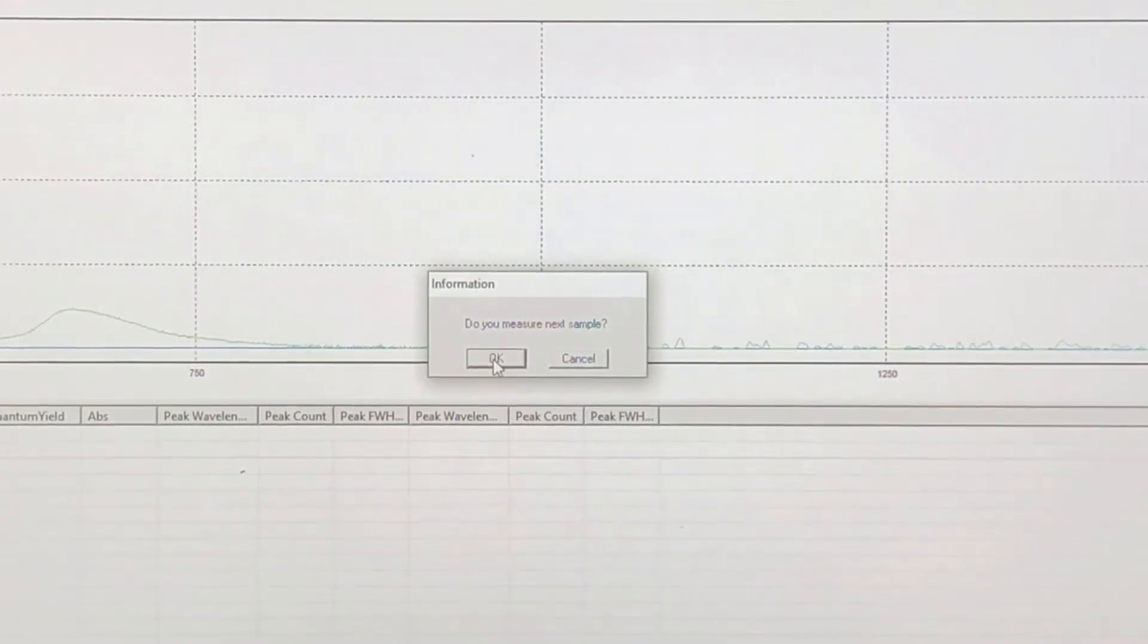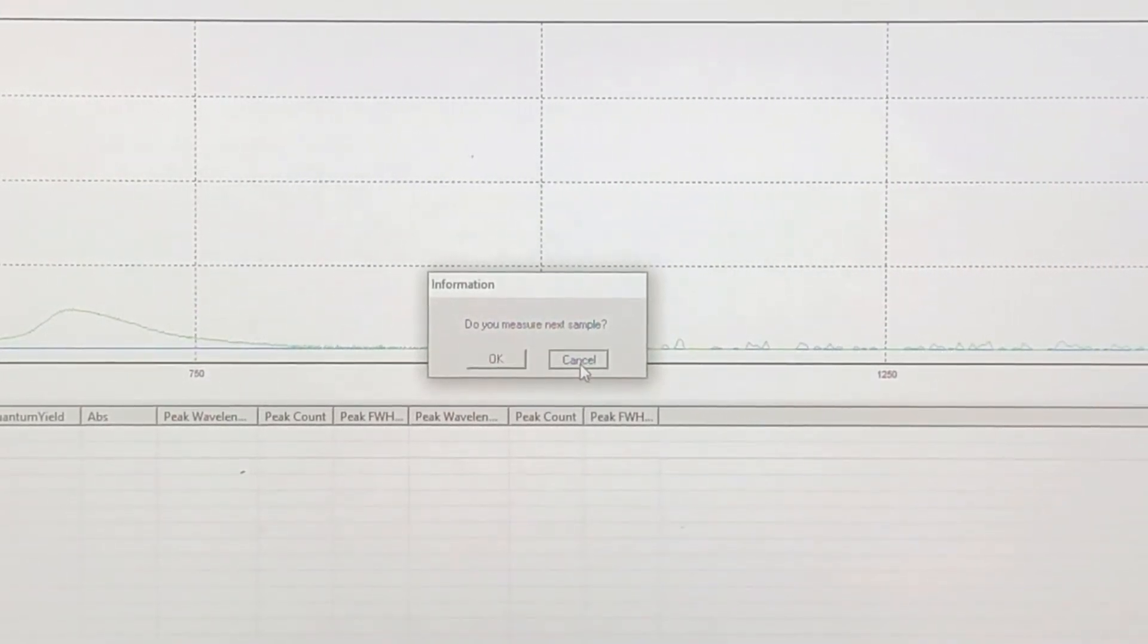When the first sample is done, you'll have the option to load another. But we'll cancel and jump to our reference measurement.